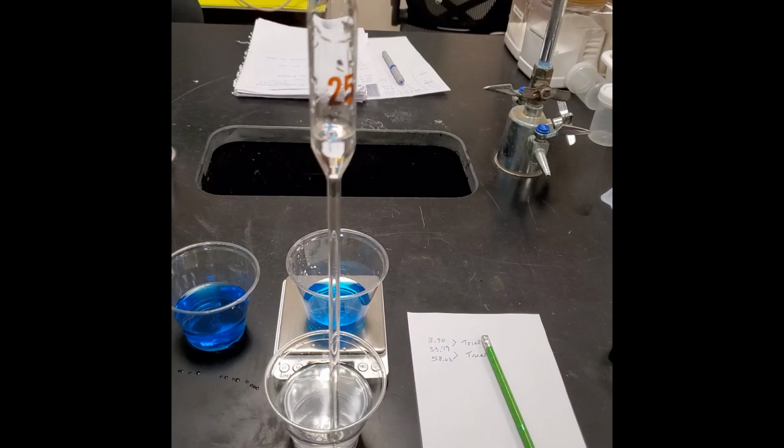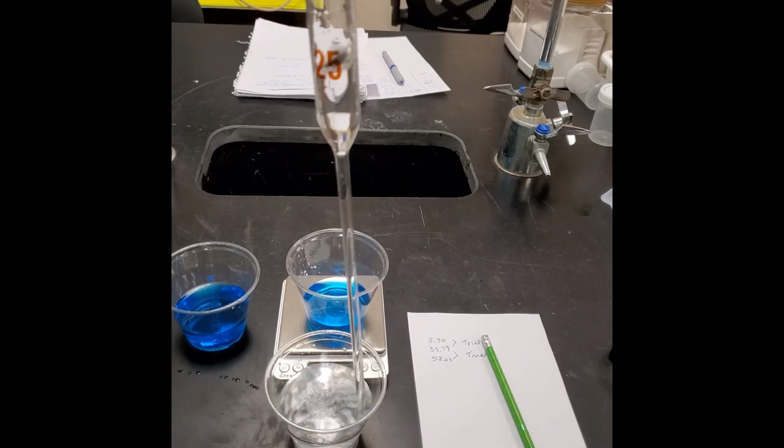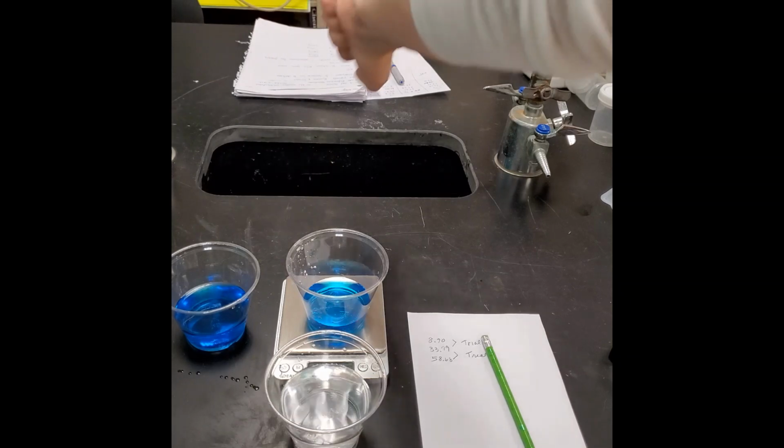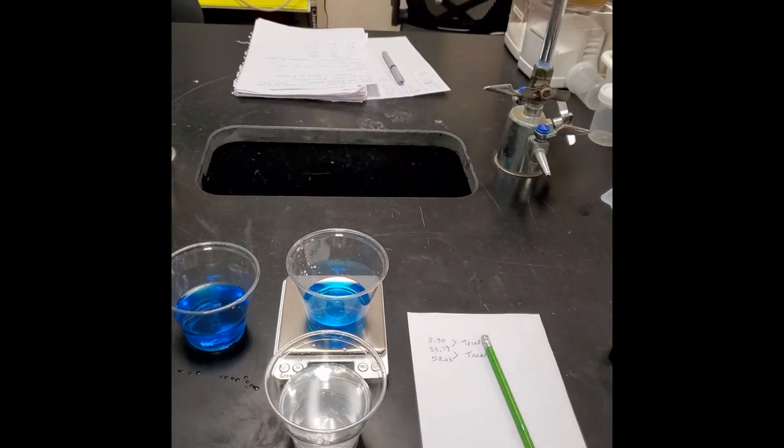Now, in between each unknown, you might want to rinse it out as well because I'm not telling you whether the unknowns are high concentration or low concentrations. You're going to be graded completely on your percent error and how close you are to the concentrations of the unknowns. So start with a clean pipette after you've done your reference solutions if you're level 1 in honors. Do your first unknown, clean it out, do your second unknown, and then clean it out.